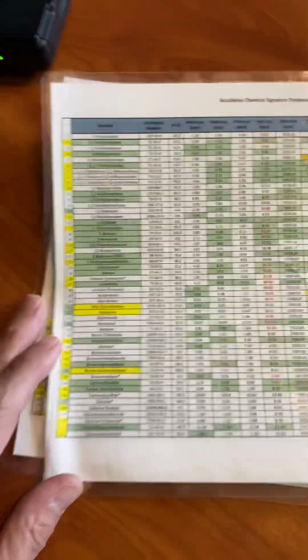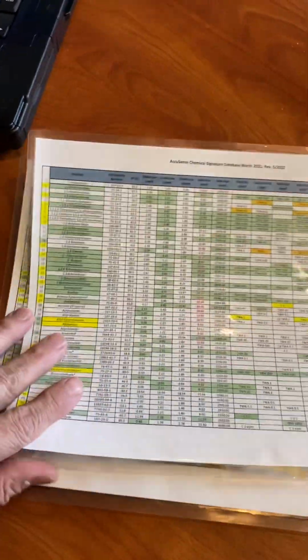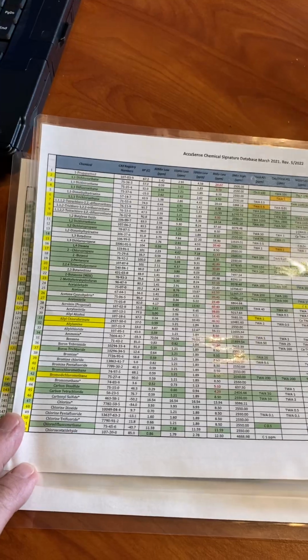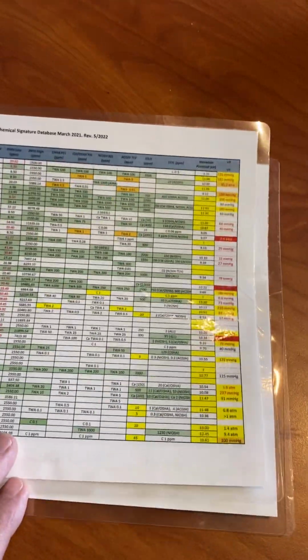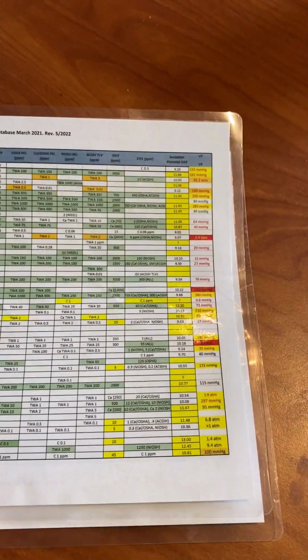We're going to go outside in a little bit here, but before we do that, I wanted to show you this representation of some of the chemicals. These are just different chemical lists. AccuSense can be customized to whatever you need, but chemicals have to be within our minus 50 degrees C up to 100 degrees C boiling point range, the more volatile things. And that makes sense, right? If we have a spill, we have more volatility of that chemical at less than even ambient temperatures.